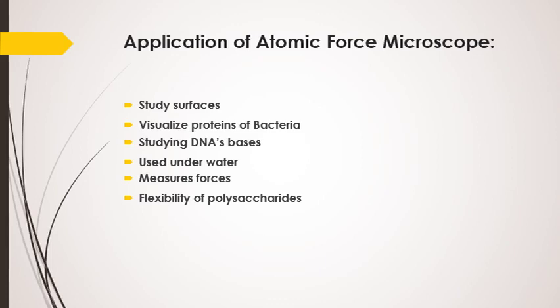The next one is studying the DNA bases. The atomic force microscope has been very useful in studying the DNA bases because it enables investigators to distinguish between bases such as adenine and guanine from differences in their electron density rates.